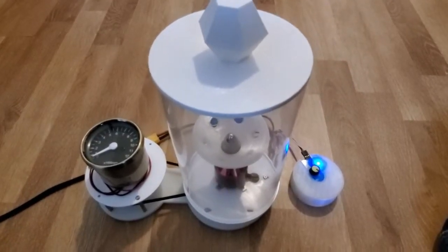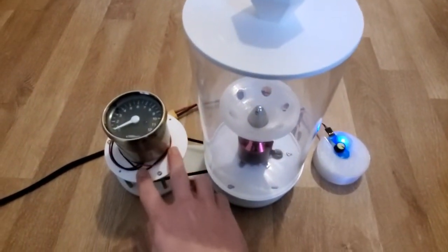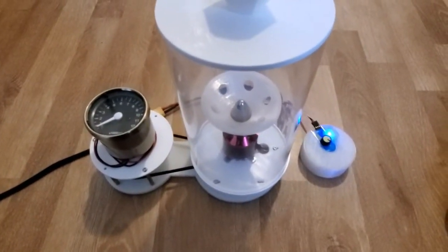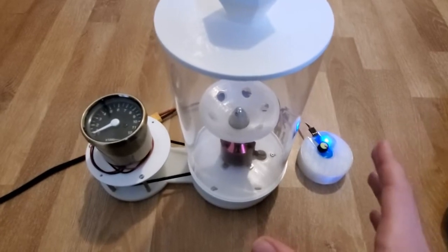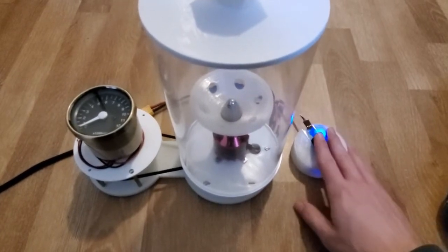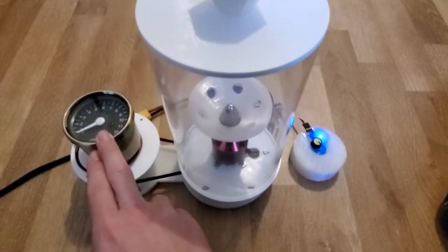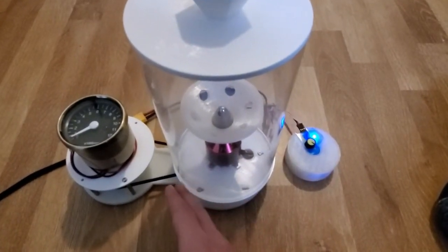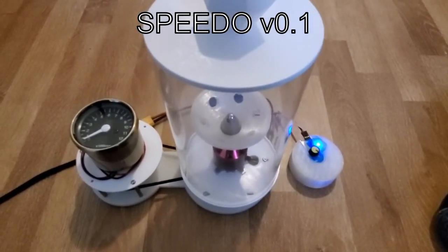There are definitely still some improvements that could be made in terms of this cover attachment, improving the rigidity of the whole system, and reducing vibrations even further. But I think overall this is kind of the ultimate 3D printed centrifuge. It has a lot of useful features — for example, you don't need to program your speed controller, it just works out of the box. You have speed reading so you can tell how fast your centrifuge samples are being run, and it has protection, belt tensioning, all those features. So, Speedo version 0.1 — hope you enjoyed.